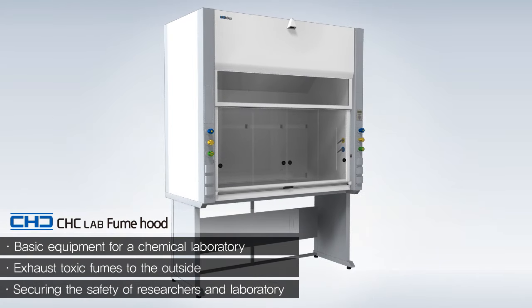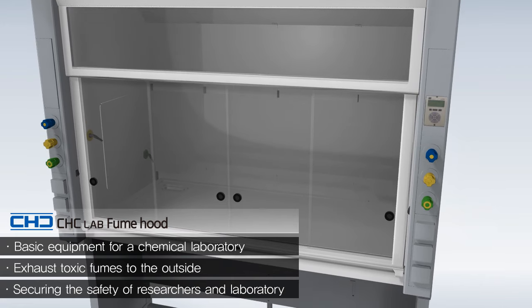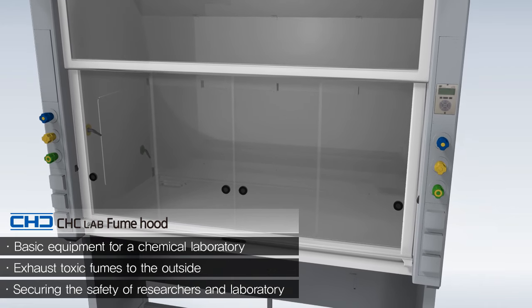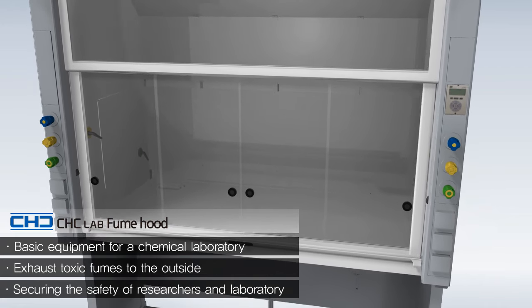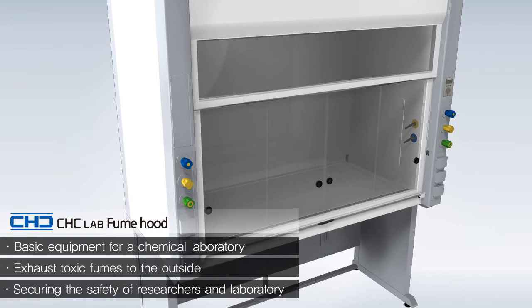Since it is connected to the HVAC system of the laboratory, exhaustion efficiency and energy saving are important. Therefore, it is critical to have a fume hood of good design and performance which satisfies the requirements.